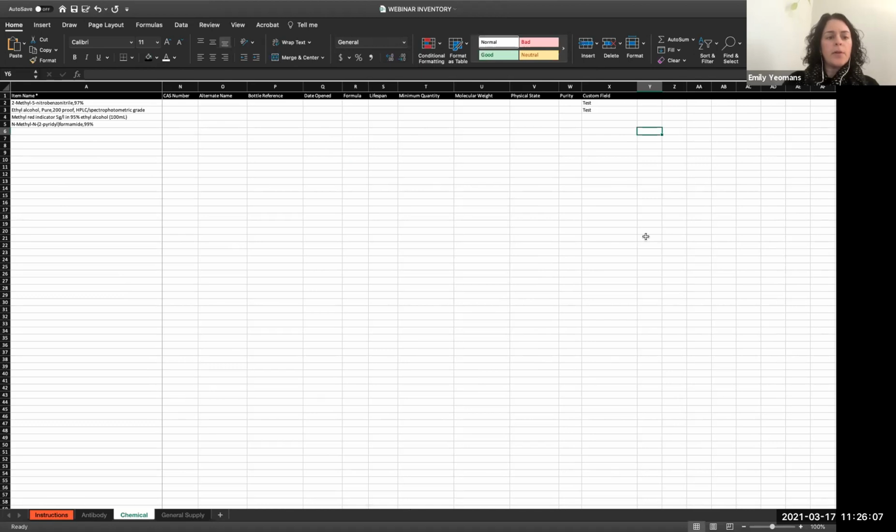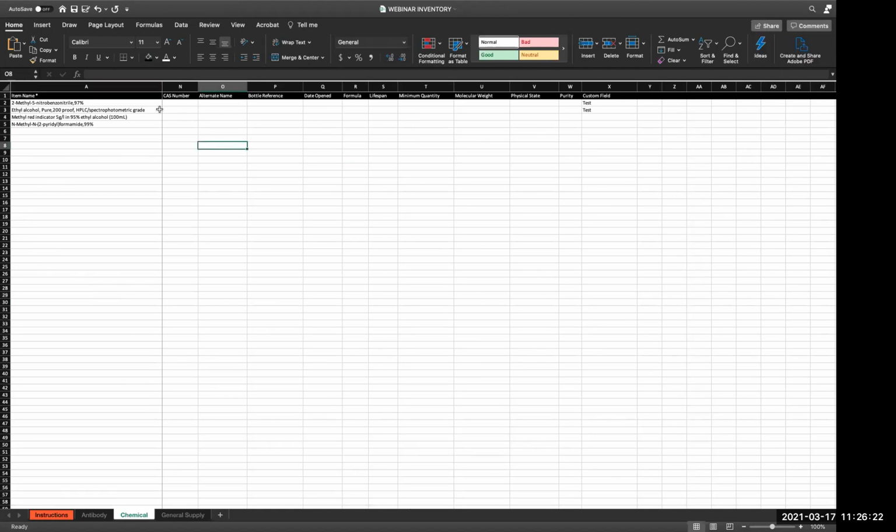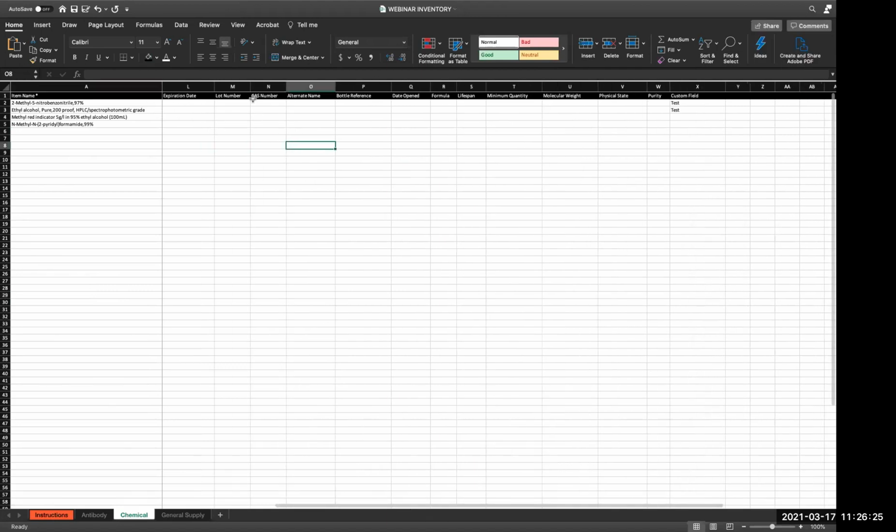And then a couple questions about that information. Are you able to upload a chemical that has more than one CAS number? And also, are you able to upload SDS information? Yes, so we do have a default CAS number field. That's where I would put your first CAS number. And then if you have an alternate CAS number, I would name it CAS number 2 and enter that as a custom field to store that information. It's easier to search by CAS number if you only include one in this field, so I would definitely suggest making another field for that.